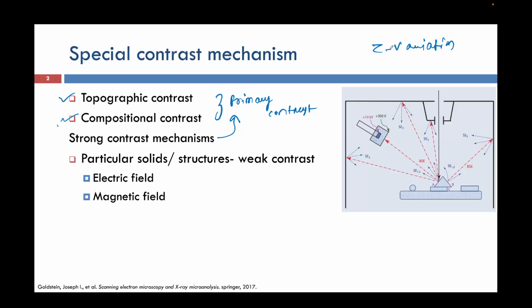In the last class we had a doubt about how, in a scanning electron microscope, the secondary electron and backscattered electron are detected. These are the two primary electron signals we knew: one is secondary electron, another one is the backscattered electron. This is a typical example of the detector system, generally known as the ET positively biased detector system. Here the ET stands for Everhart Thornley.